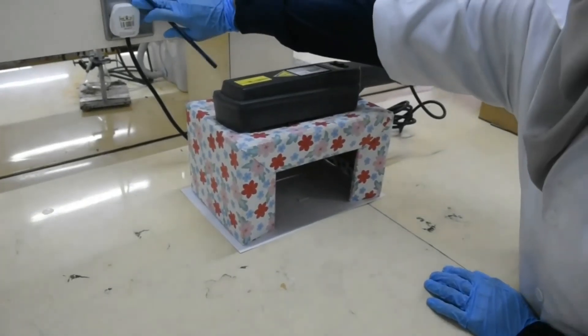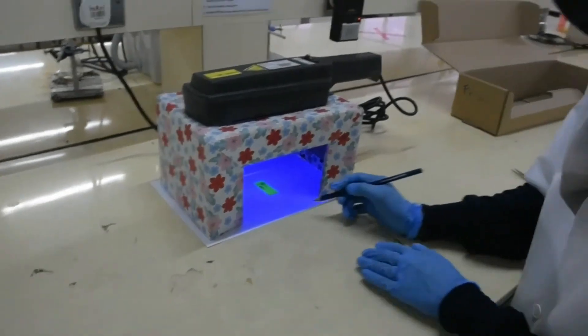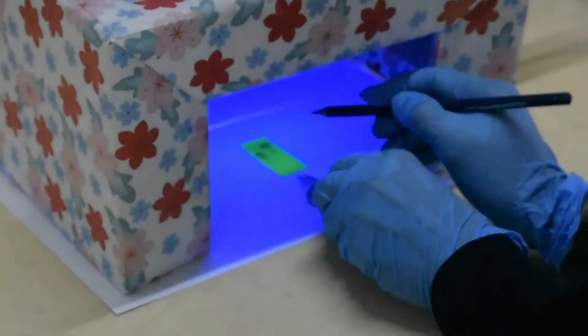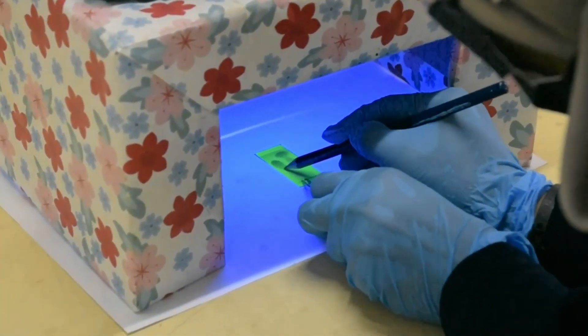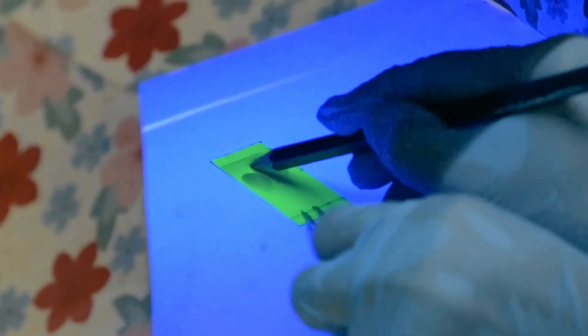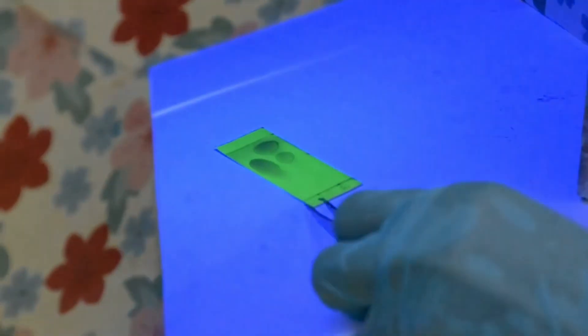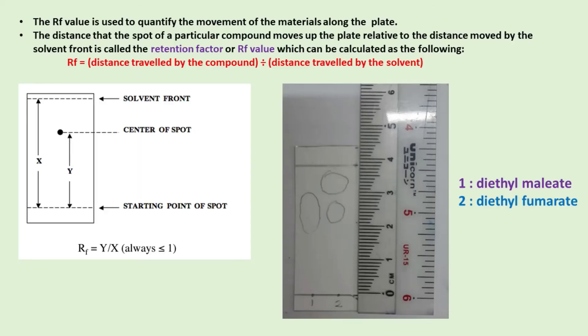Observe the spots under UV light and circle the spots. Calculate the Rf value for the spots observed. This is the TLC plate with the results.